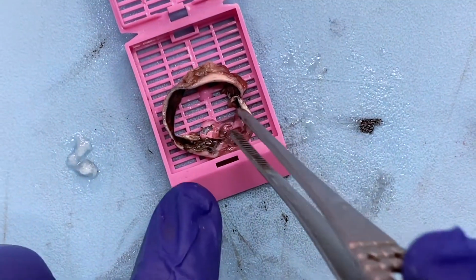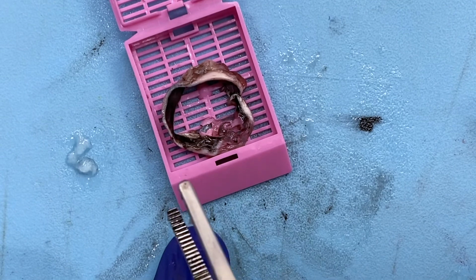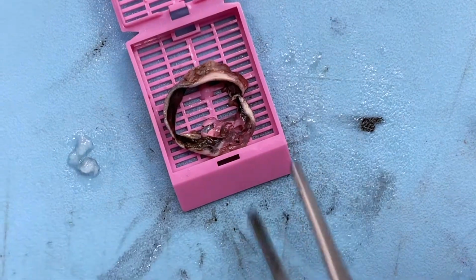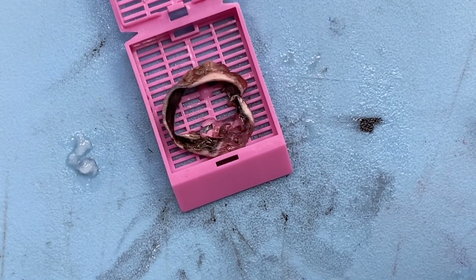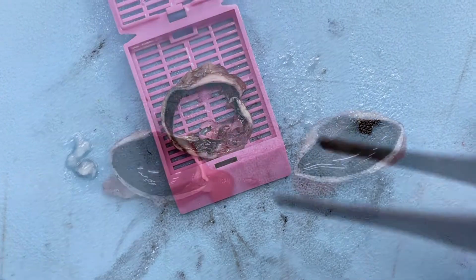There we go. Again, we want to make sure that we're allowing the histotech to be able to cut into the pupil and the optic nerve in the same cut, and that they don't have to go too deep to get into one or the other. And that's really the most important section with these specimens. PO section is what they call it. In a lot of places, especially if this is a glaucoma case, that section is more than enough, that and the optic nerve margin.